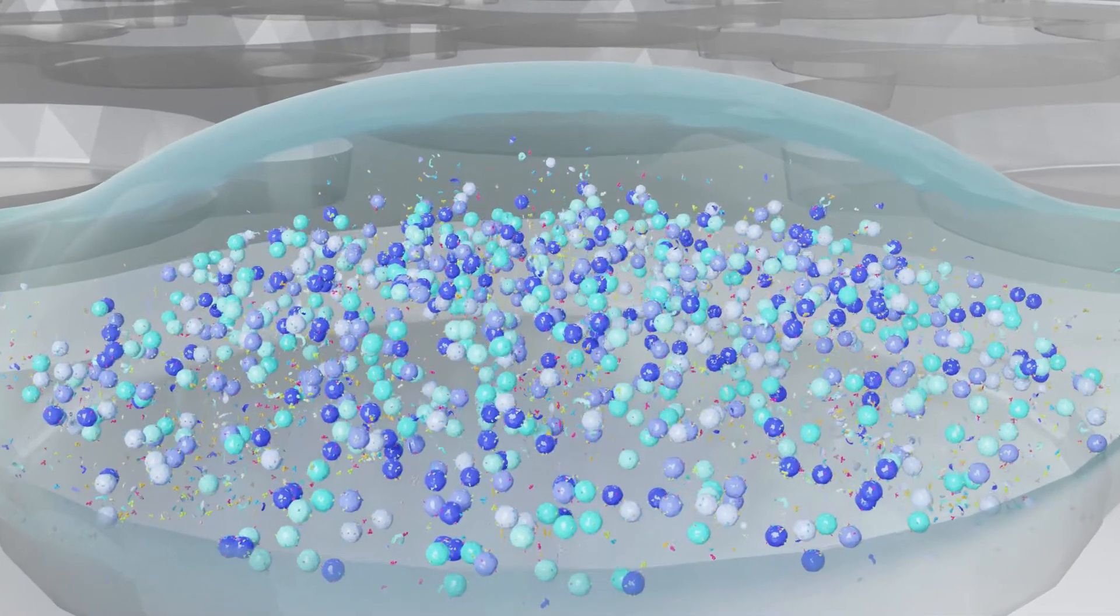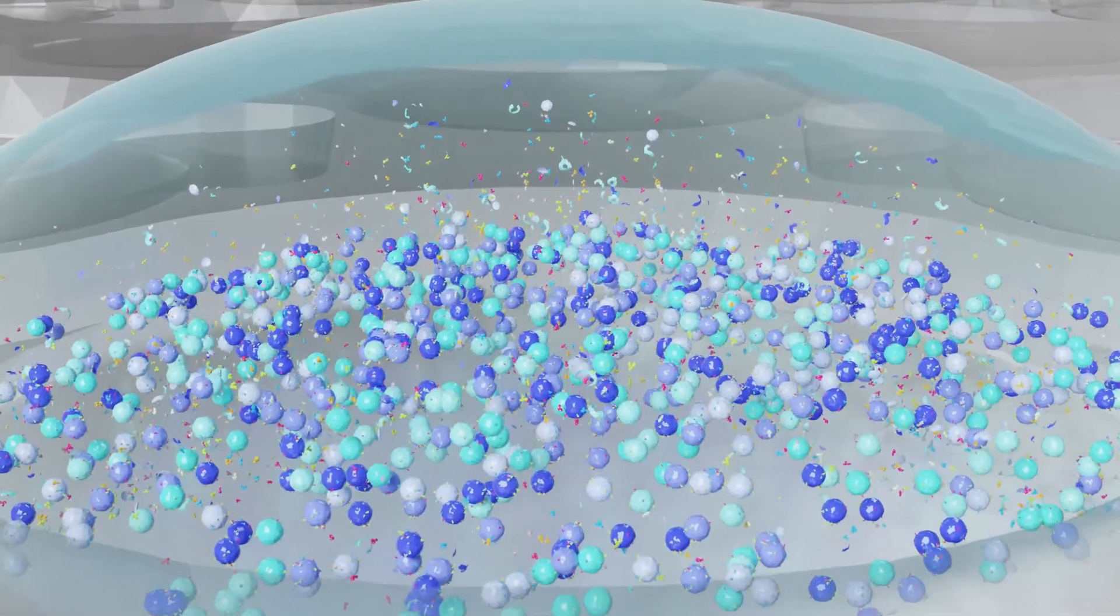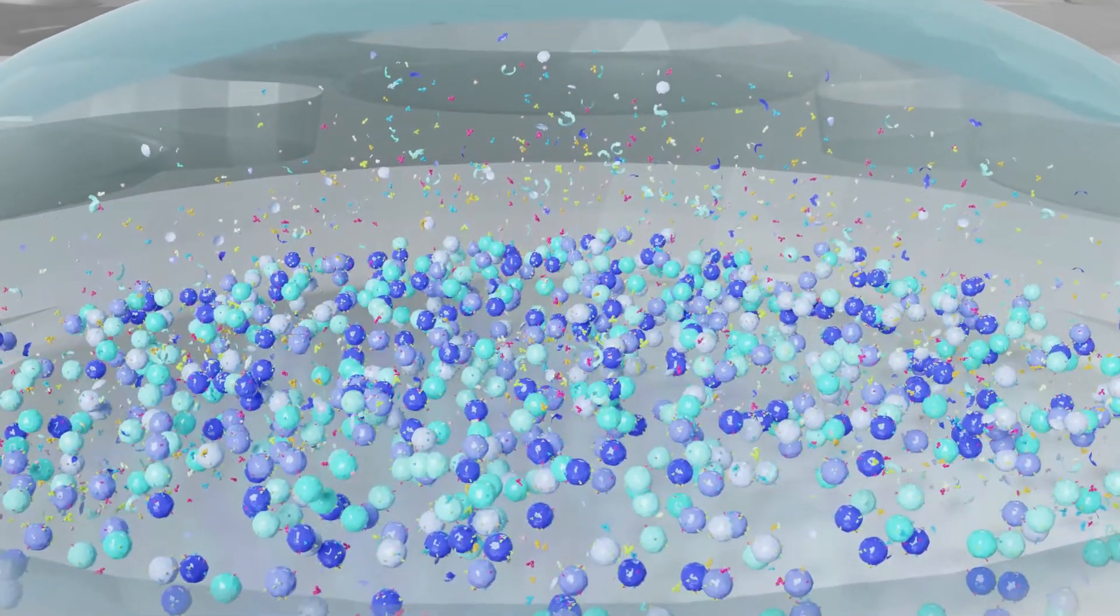Gravity then causes the cells to fall to the bottom of the wells where they settle gently on the hydrophilic coating without any physical attachment.